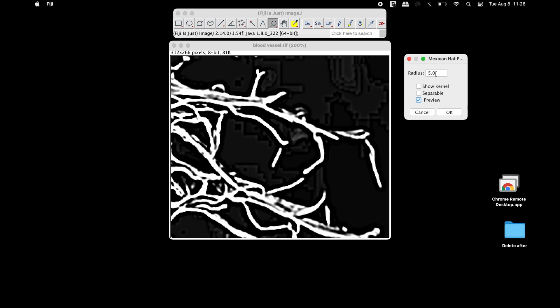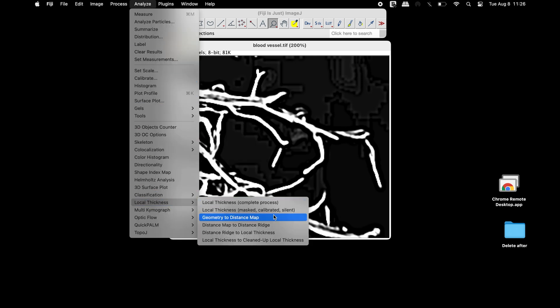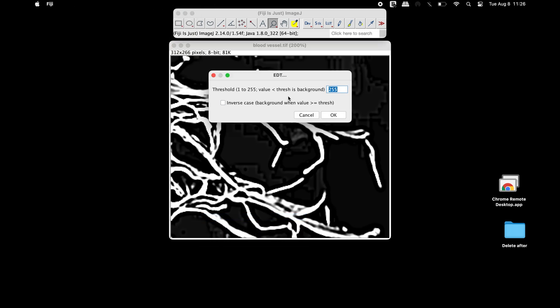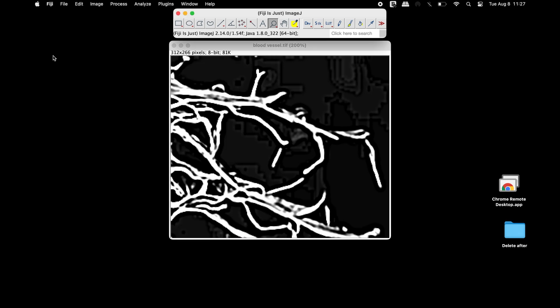Once the radius is adjusted, click OK. Now click on Analyze, scroll down to Local Thickness, and click on Geometry to Distance Map. In this window, adjust the threshold according to the image type — for instance, using 30 for this image. However, the image appears to contain noise not part of the blood vessels, so the threshold may need to be changed. Close this window and restart the process.